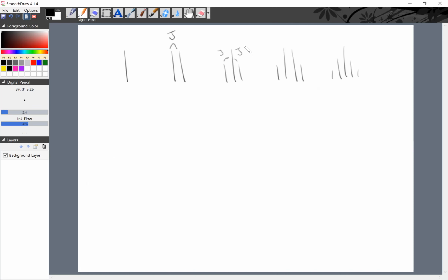But for us, we're just going to call it singlet, doublet, triplet, quartet, pentet, and then of course anything past that, we would just call it a multiplet. I do have to warn you that you can have doublets of doublets. Let me go back to that benzene.